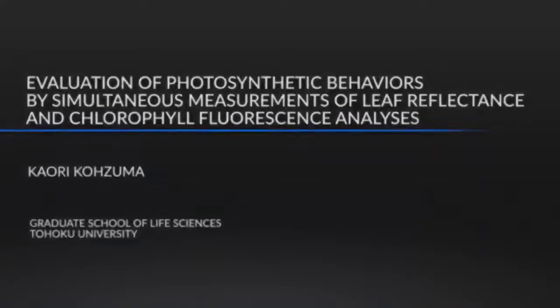The simultaneous measurement of leaf reflectance with chlorophyll fluorescence analysis using an already known mutant plant model facilitates the establishment of new reflectance parameters. The construction of new leaf reflectance parameters by our method allows real-time monitoring of changing plant behaviors under natural environmental conditions.